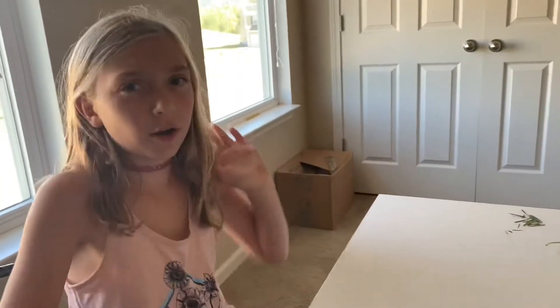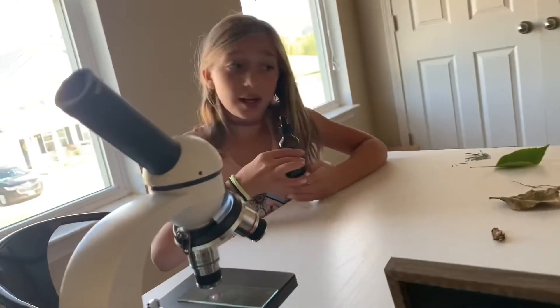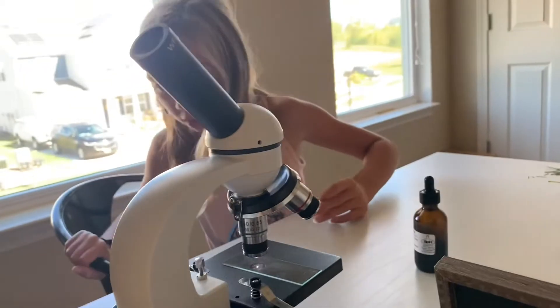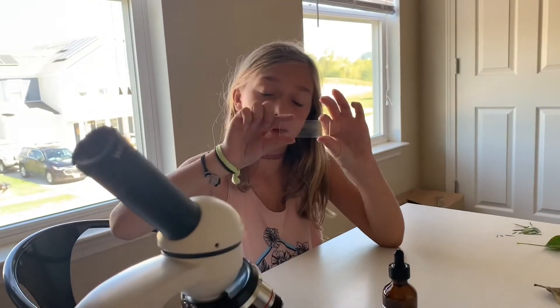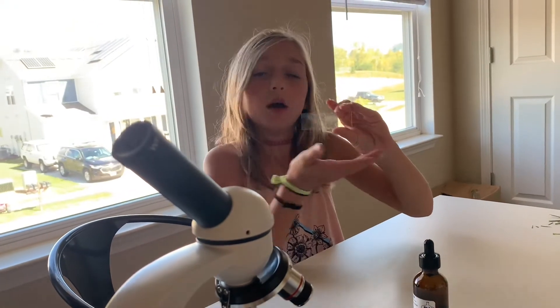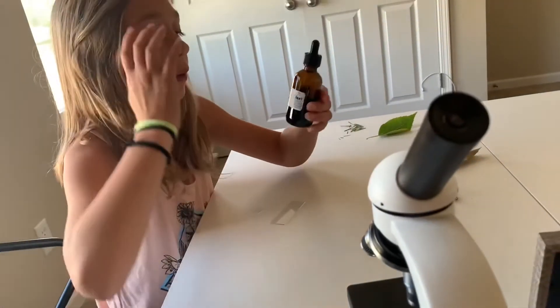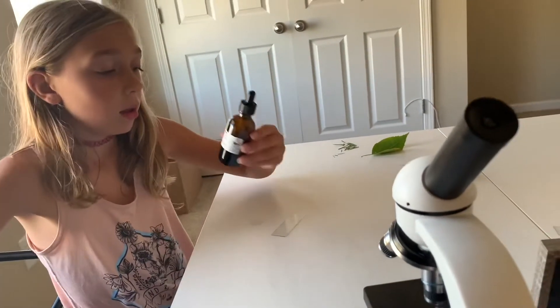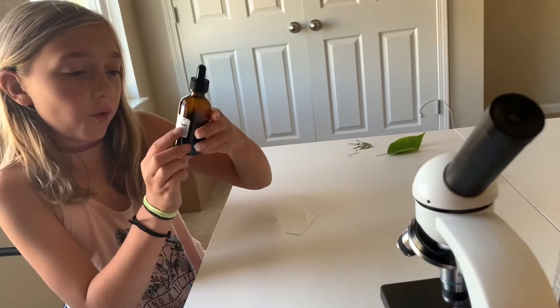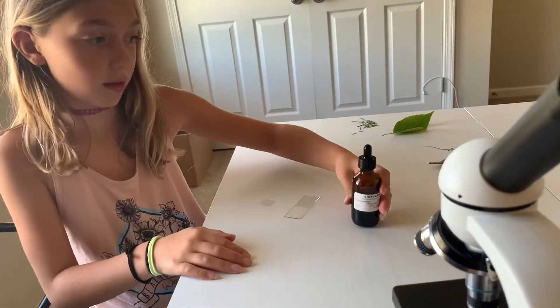Hi! Today we are going to have so much fun because we are experimenting all this stuff with our microscope. All you need is a microscope, obviously, a slide plate, and then a bottle of blue dye — I'm not sure exactly what it is, but blue dye so you can actually see things.